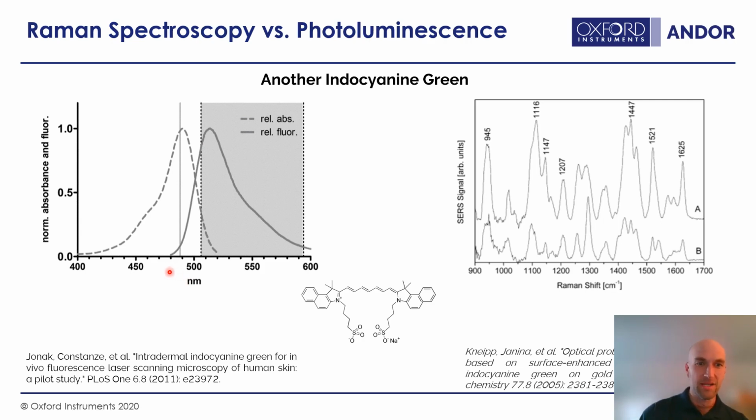But just to give you another view, here's the fluorescence spectrum, photoluminescence spectrum. Here's its absorption. This is sort of the excitation for that fluorescence. And these are both blobby spectra. Again, I'm just making the point that photoluminescence has a relatively unstructured emission or spectra associated with it that are hard to separate. They all look very similar. Or, I'm sorry, that's a gross generalization. Many of them look very similar.